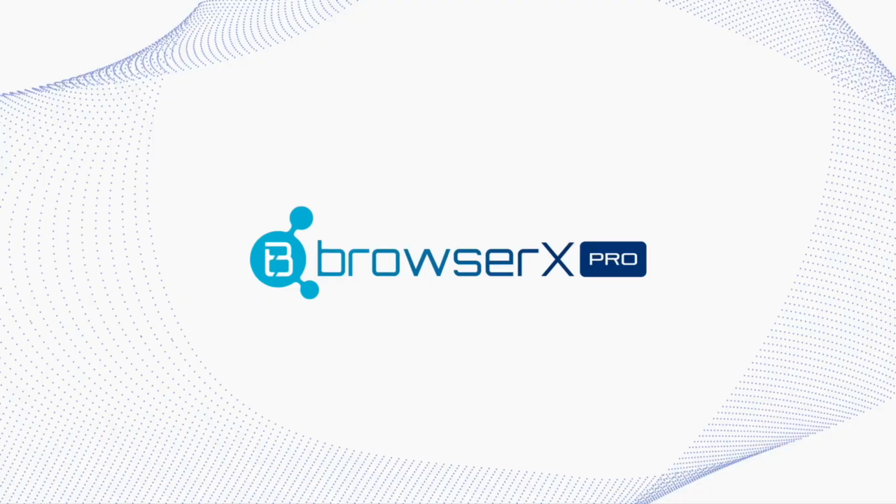We've now reached the end of our tutorial. We've covered the general workflow for analyzing single-cell RNA sequencing data on BBrowserX Pro, from data submission to cell type annotation, differential gene expression, and other advanced analyses. I hope this video has given you the foundation to navigate your own data analysis.